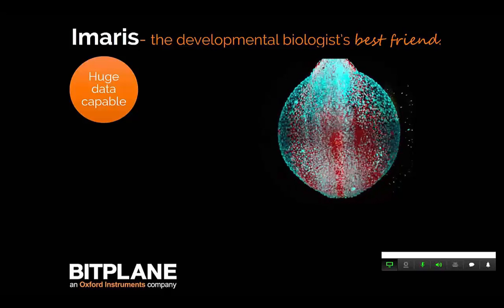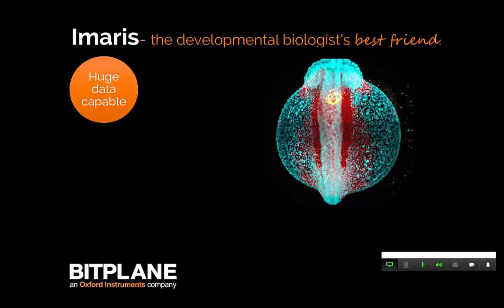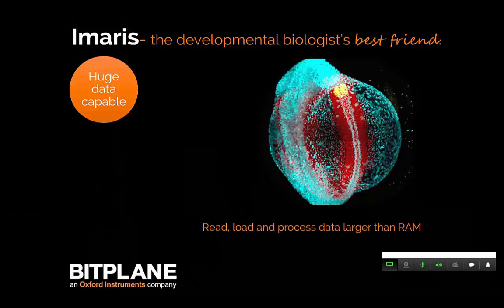And this is just here as an illustration of the size of the data that we as researchers are facing these days. One thing that I wanted to emphasize is that Imaris is capable of handling these large file sizes. 10 years ago, a large file was a gigabyte. Nowadays, a large file is in the terabyte range. Imaris reads, loads, and processes data that is significantly larger than the amount of RAM you have available in your computer.